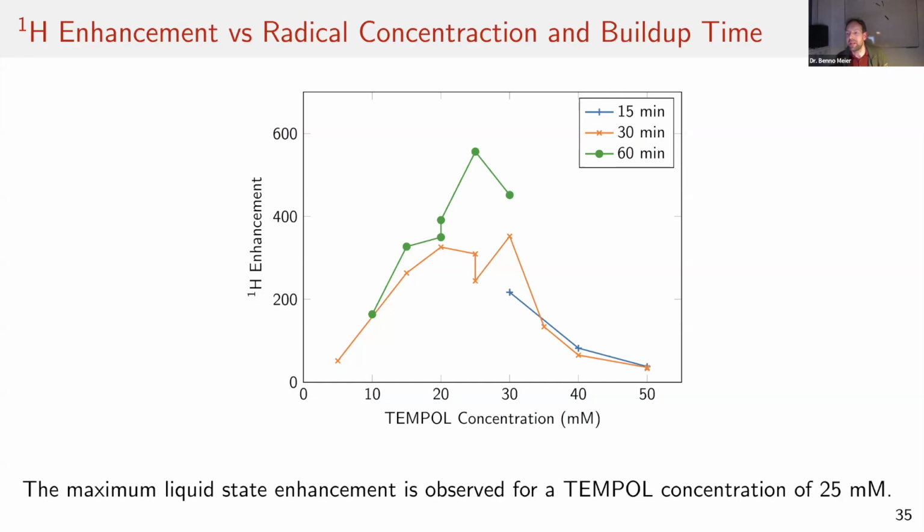So maybe I comment anyway. Yeah. If I may. So in these experiments here, actually the dilution is 20-fold. So we use a 40 microliter bullet volume and 800 microliter of liquid. That helps us with filling the NMR tube reliably. So it's not as bad as it might be with the radical concentration.